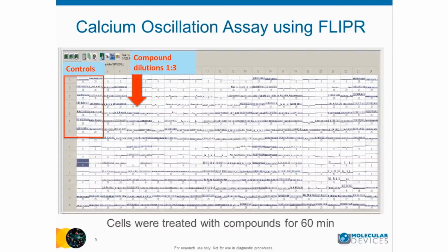You can see control samples and also samples treated with different concentrations of drugs. Each well of the 384 plate contained a single uniformly sized spheroid and generated highly consistent performance across the wells and plates. Neural spheroids were exposed to compounds in concentration response for either 60 minutes or 24 hours.